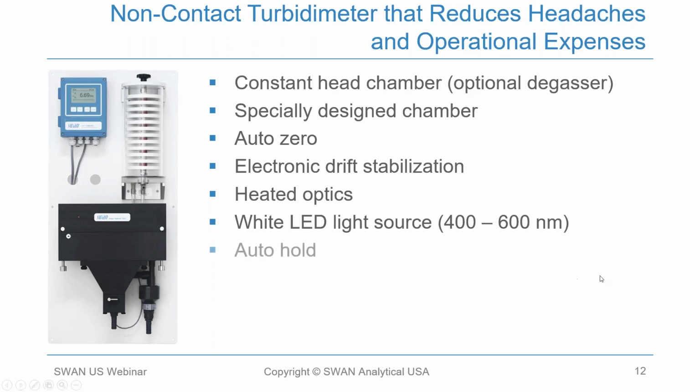One of the things that I really like about the instrument too is the instrument goes into auto hold mode when the top is raised, and it'll automatically go back into operation when the unit is closed. The amount of time it's in the hold mode can be programmed. And this reduces the potential for a violation for not taking your 15-minute readings.